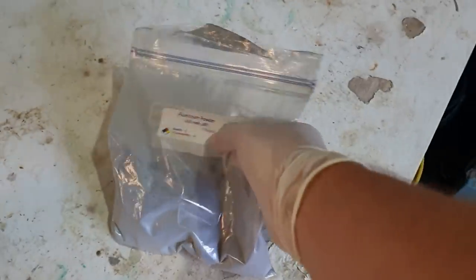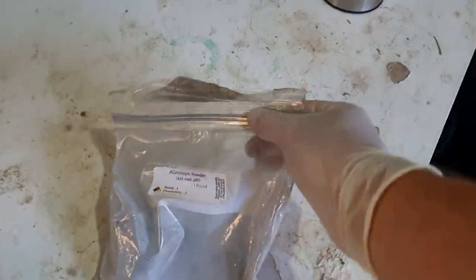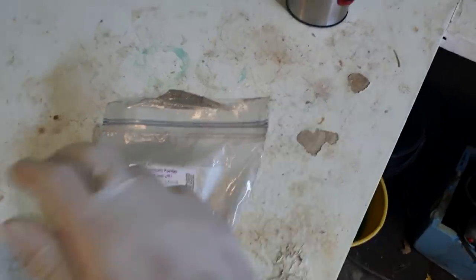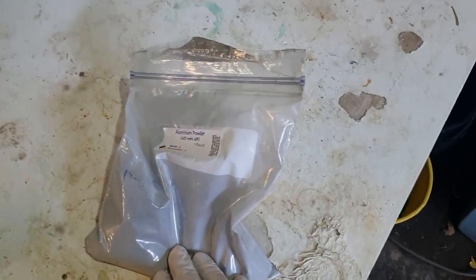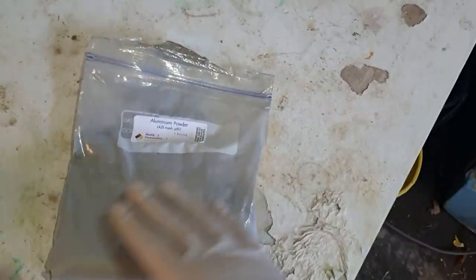I got two pounds of this — this is one pound. I got two pounds back in early 2013 when I wanted to do a thermite week on my main channel. I used most of that first pound up in that week, and then the second pound has lasted me well — at least six years. It's one of the chemicals I've been using consistently for all these years.